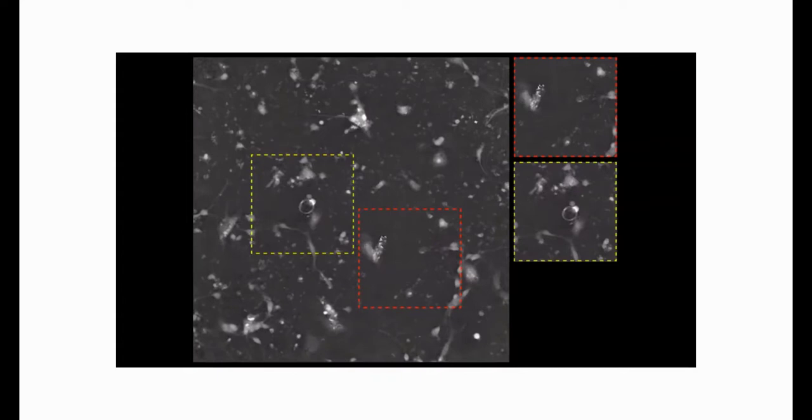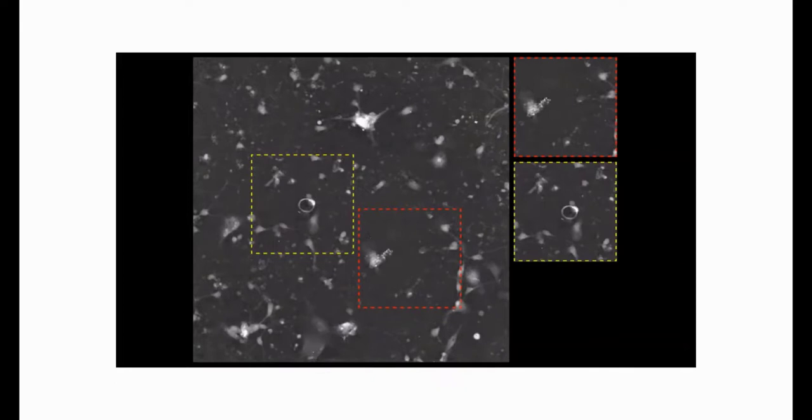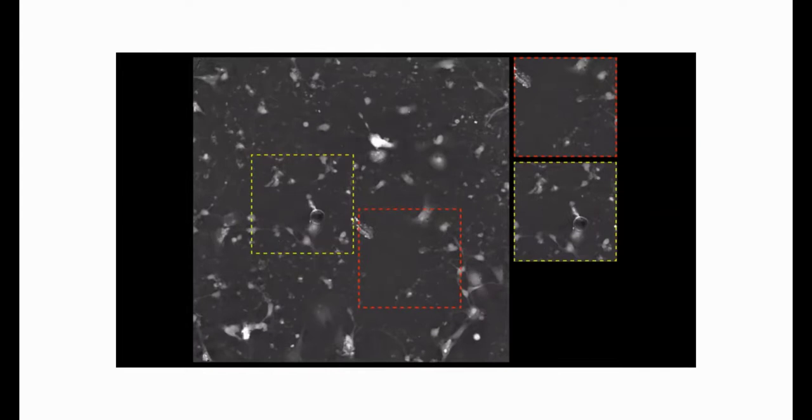Now, the cell below appears to have done nothing, but it has. It's been getting bigger and bigger and bigger, up until the point that it divides again itself. And then the same will happen again.